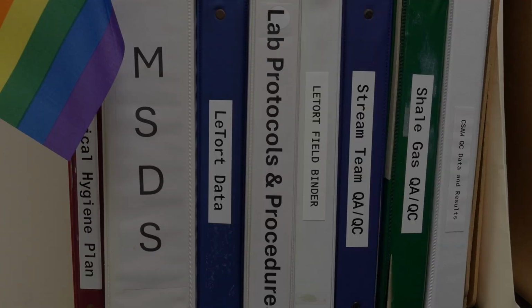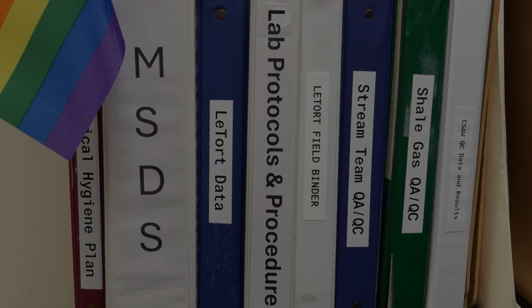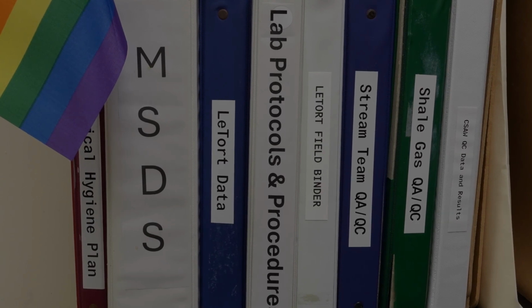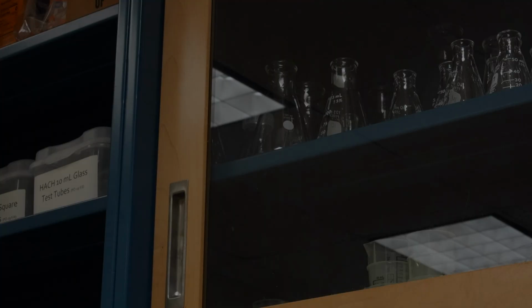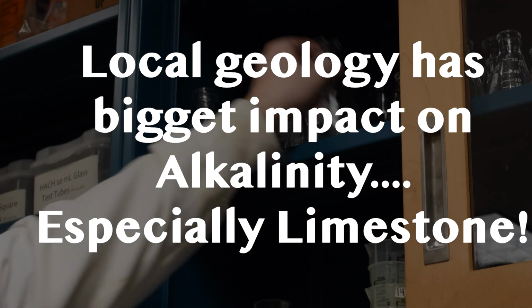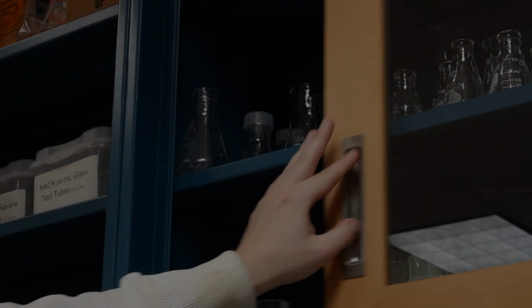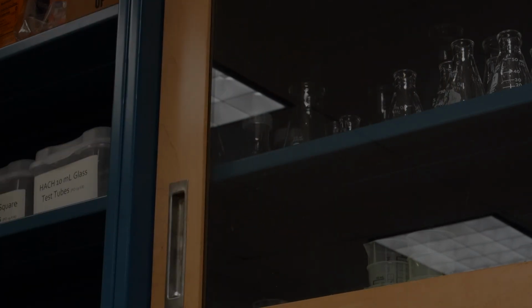Alkalinity is the ability of water to resist acids and changes to its pH. It is mostly determined by the amount of dissolved compounds such as carbonates and bicarbonates present in water. Local geology has the greatest influence on alkalinity. Limestone, which is primarily composed of calcium carbonate, is one of the biggest contributors to alkalinity.